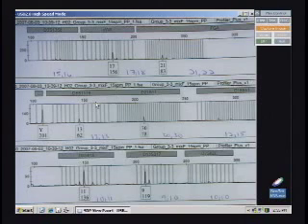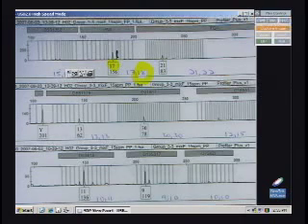Okay, so group 3, and this was just 15 sperm. Let's see, you did get the 17, but not the 18. There's a blip. Oh, that little thing? Yeah, well, okay. It didn't pick up the 18, I'll say that's a 50 RFU. You know what we'll do? We'll just make it like this. There we go.